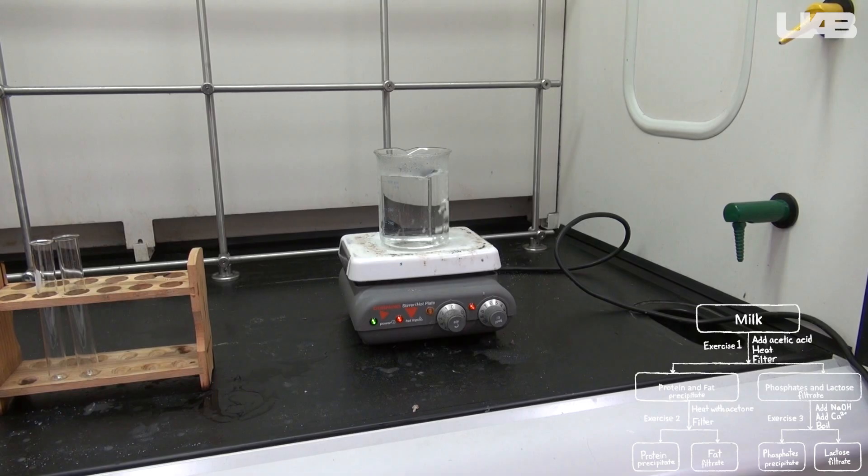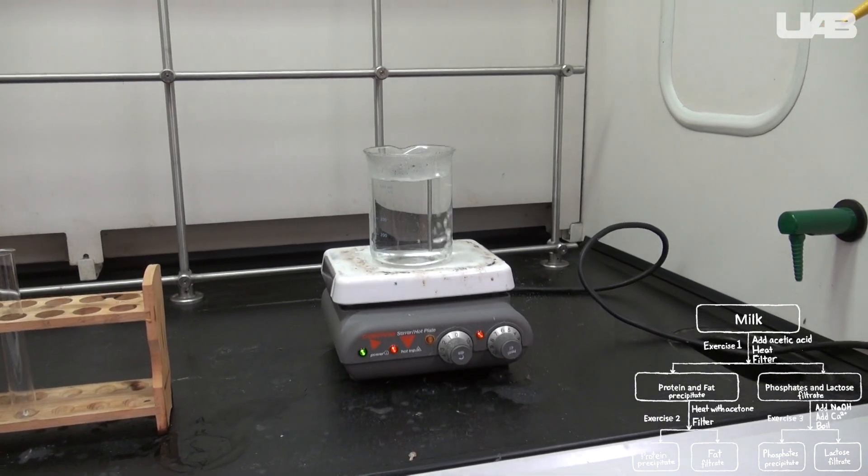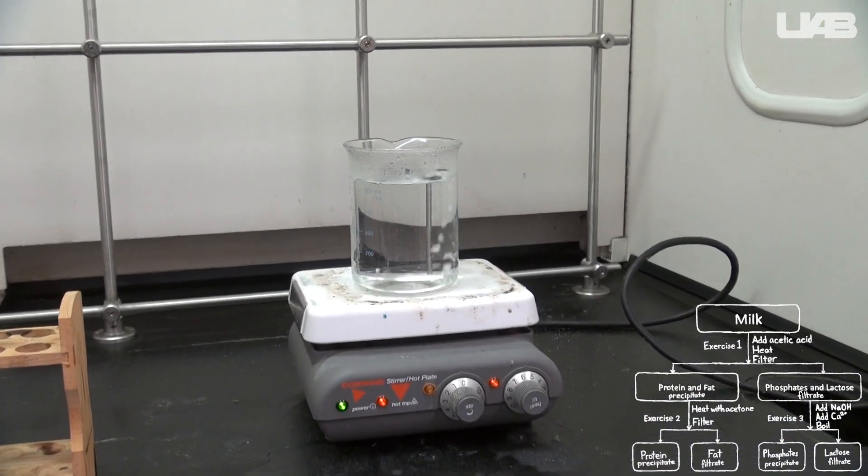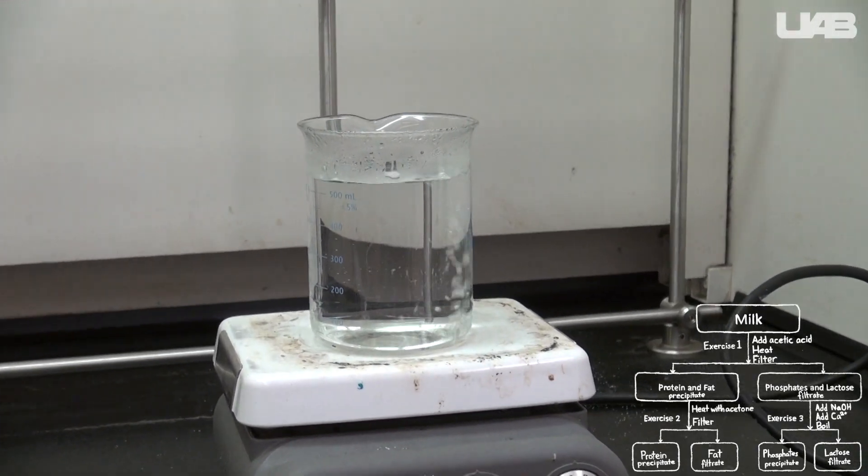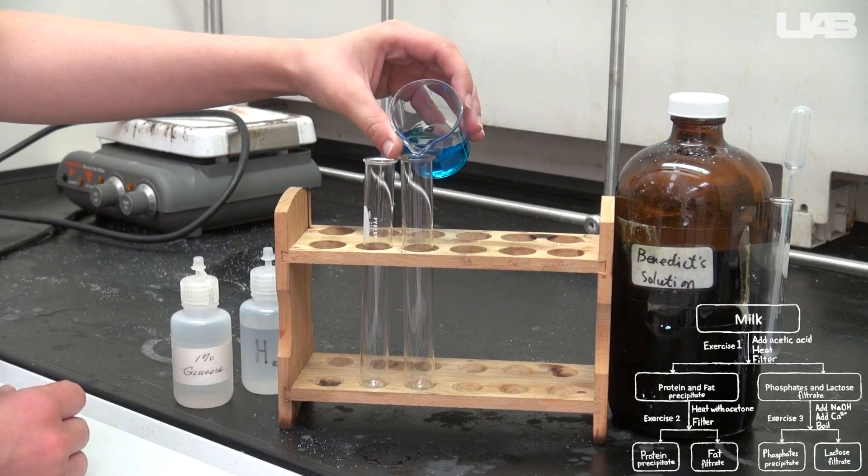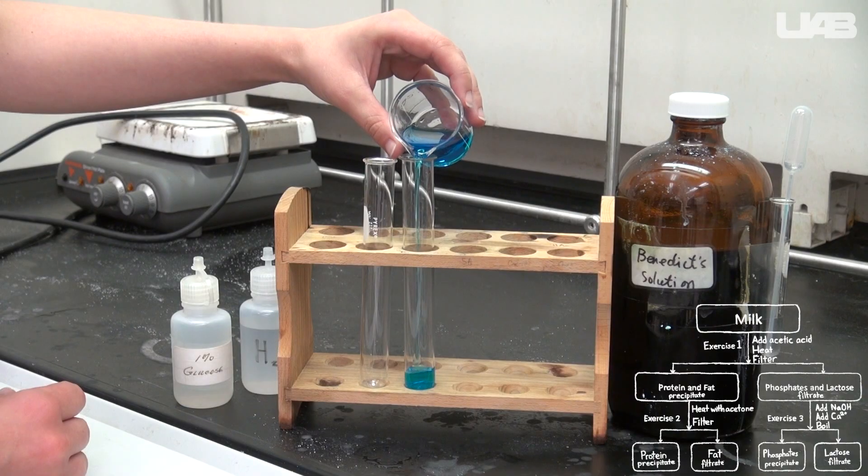You'll need a boiling water bath, so go ahead and start heating a beaker of water on the hot plate at the beginning of the time period so that it will be boiling by the time you're ready to use it. Take two test tubes and add about 5 milliliters of Benedict's solution to each.